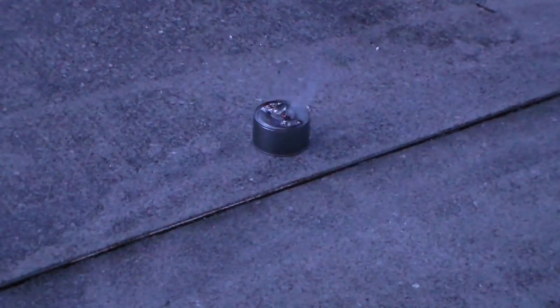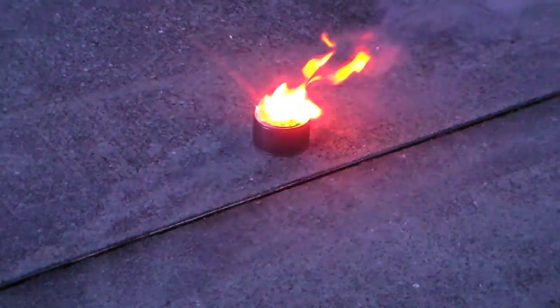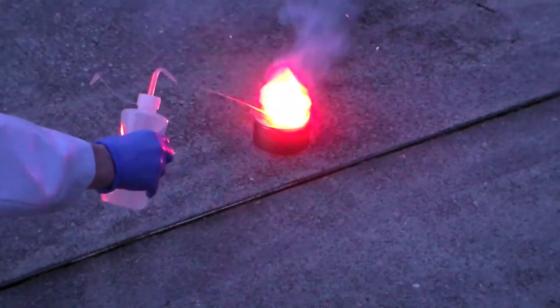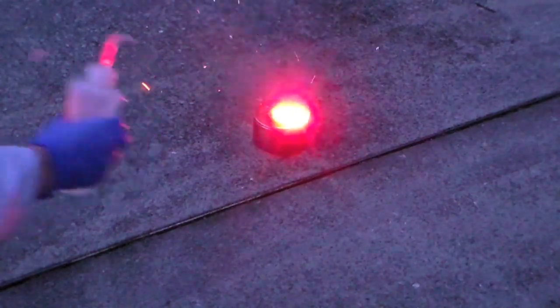An interesting side note is that you can't actually use water to put out a lithium fire. Here I am adding water to some smoldering lithium and you can see it roars back to life. The water actually reacts with the lithium producing flammable hydrogen gas, and flammable gases aren't that great at putting out fires.